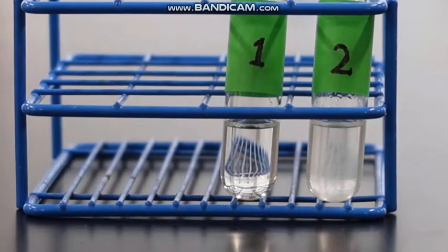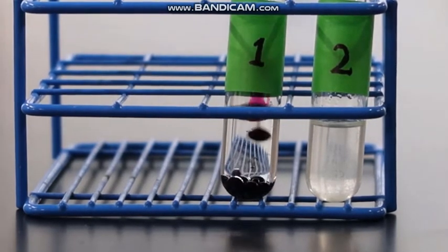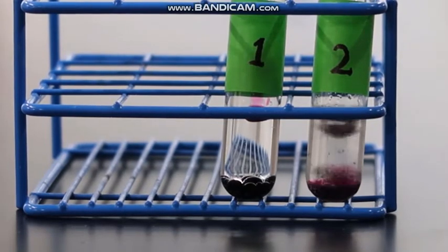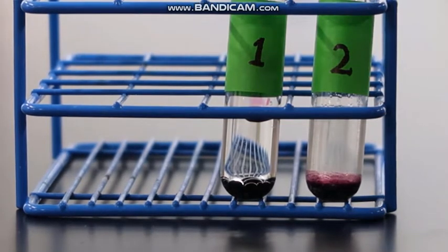For our next set of observations, we'll be adding potassium permanganate to test for unsaturation. Test tube 1 contains a solution of vegetable oil and hexanes. Test tube 2 contains a sample of Crisco and hexanes.